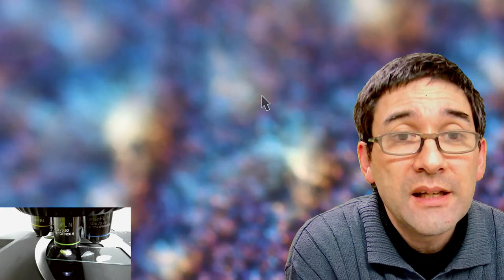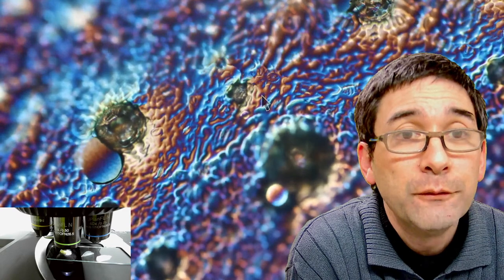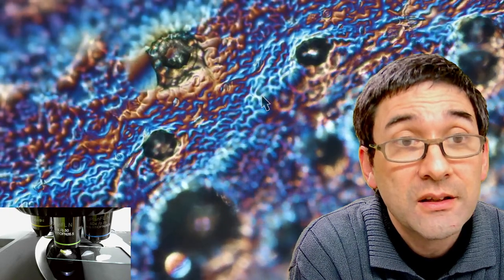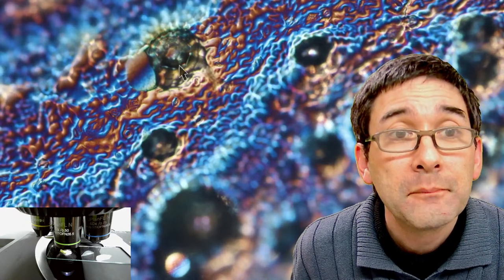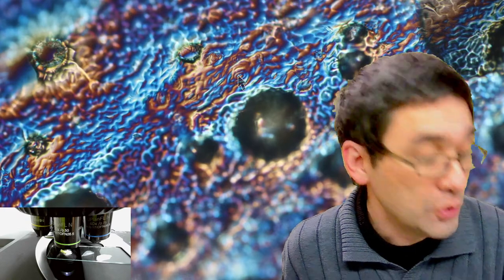That's one of the nice things — to show you that different plants have different shapes, or at least the cells or the surface of the cells. You could see this oval structure over here — this here is also a stoma, a stomate, a little opening into the leaf. That is one of the nice things to try out — I encourage you, if you don't have any samples available to directly look at, to experiment a little bit around with the glue.